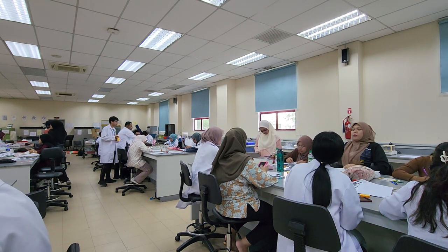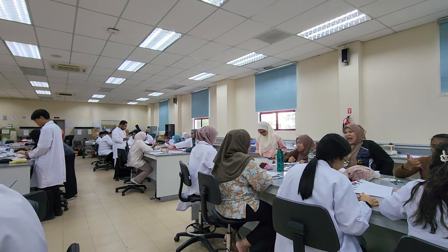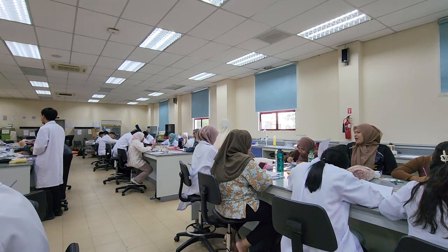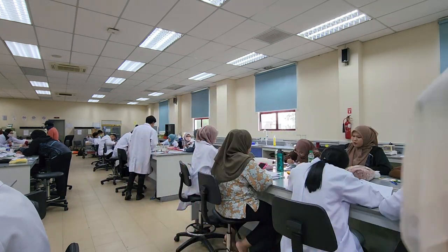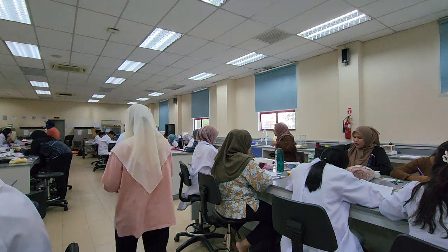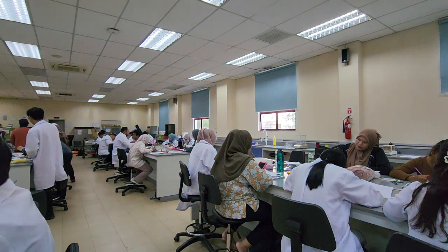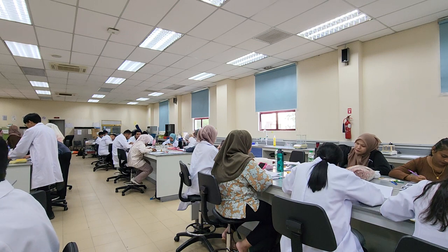Next generation of khalifah. Panggil apa ni macam ni? Potong depan macam ni? Kan dah belajar dah. Apa pula potong depan macam ni? Transverse. Yang satu potong muka depan, satu potong kepala atas. Satah tu, satah pemotongan. Kan belajar itu. Kalau yang macam ni longitudinal. Long lah, sepanjang panjang badan. Longitudinal. Tulislah longitudinal section. Yang macam ni? Kalau macam tu potong merentas. Transverse. Bahasa lain transverse apa? CS, cross section. Apa kau buat? Terus seronok sangat ni?